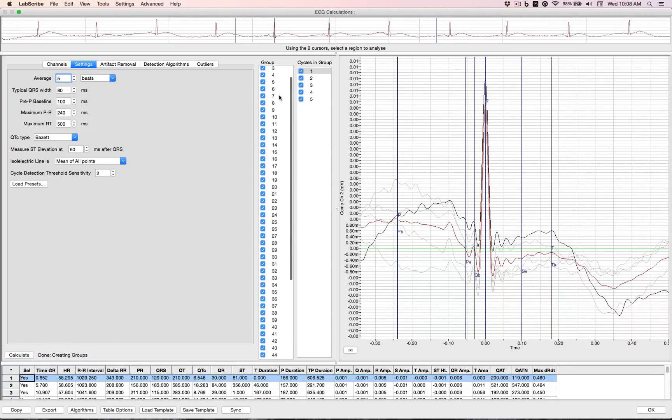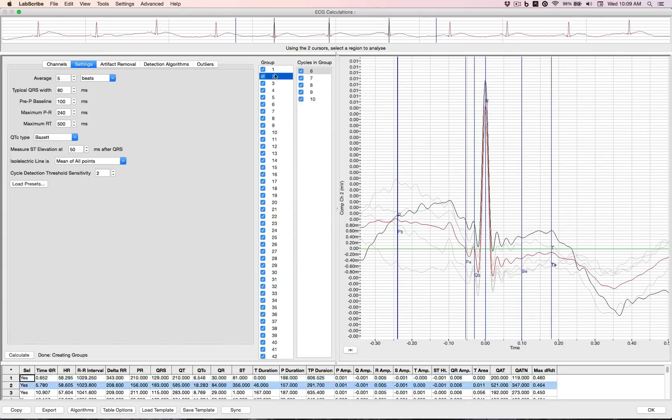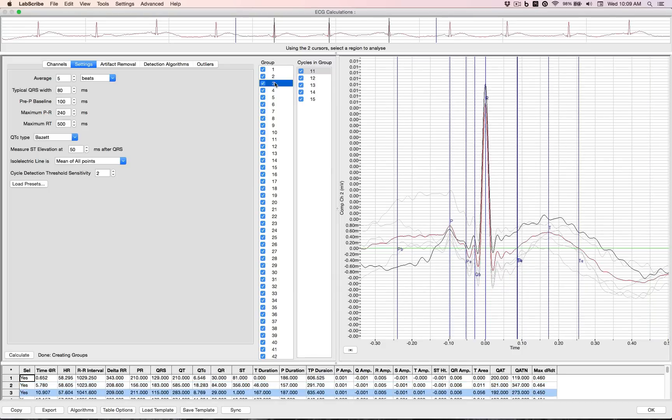And now it is broken down into the various groups and the cycles in each group, allowing us to go through each section of the trace and remove any outliers.